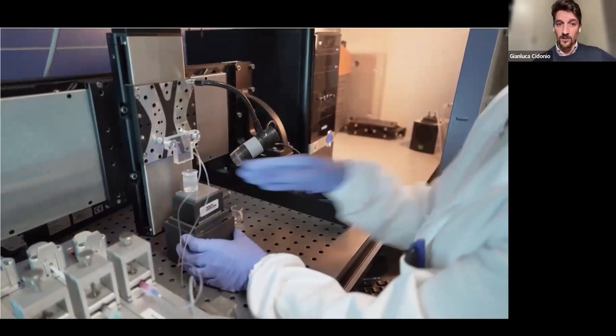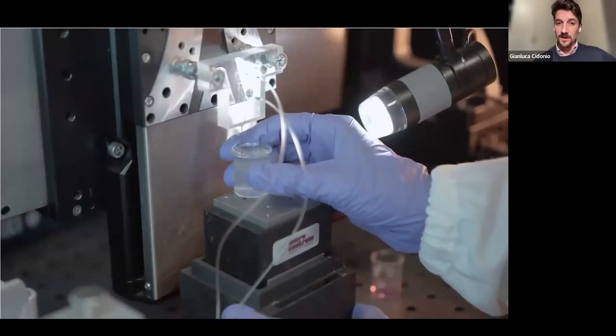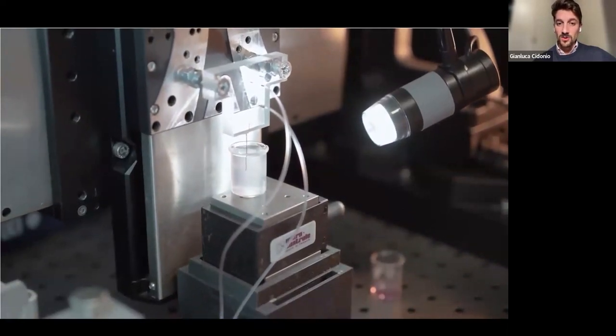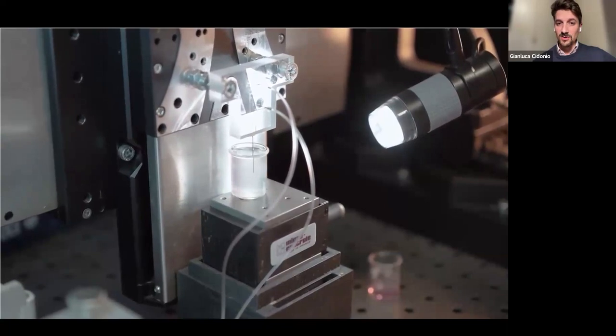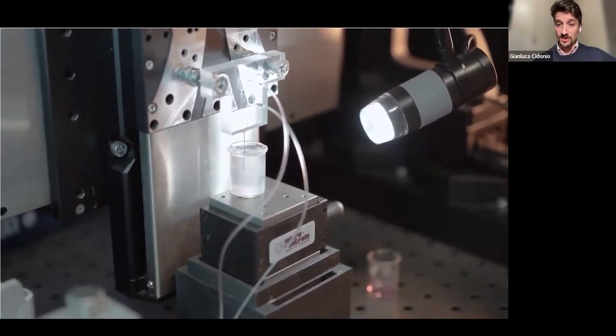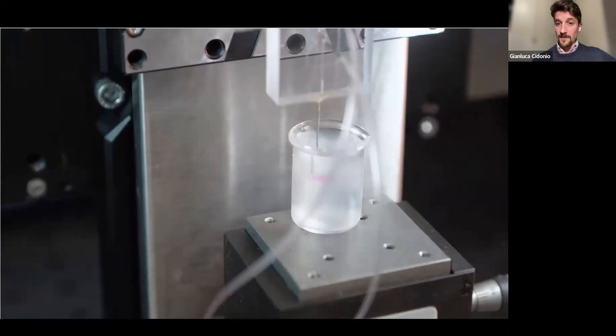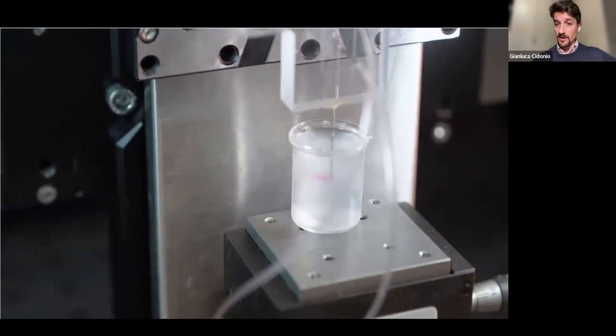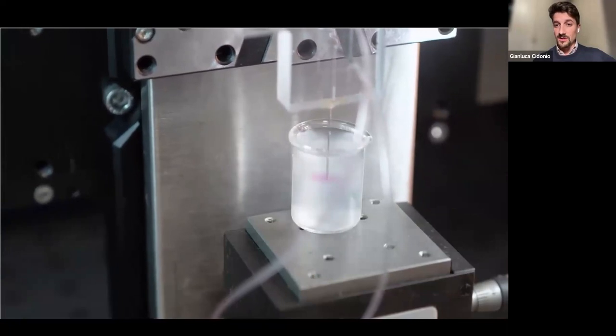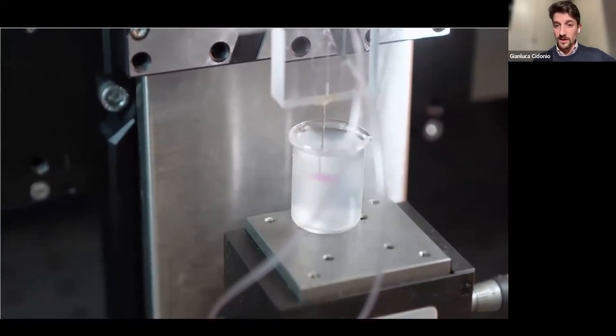So we have biomedical engineers in the lab who are trying to engineer new printers routinely. This is one that we have in the lab, and it allows us to use a chip that we can attach to the printing system. We can move it around, for example, and here Martina was printing in a gel, an agarose fluid gel, to create intricate structures that are supported and prevented from falling under gravity.